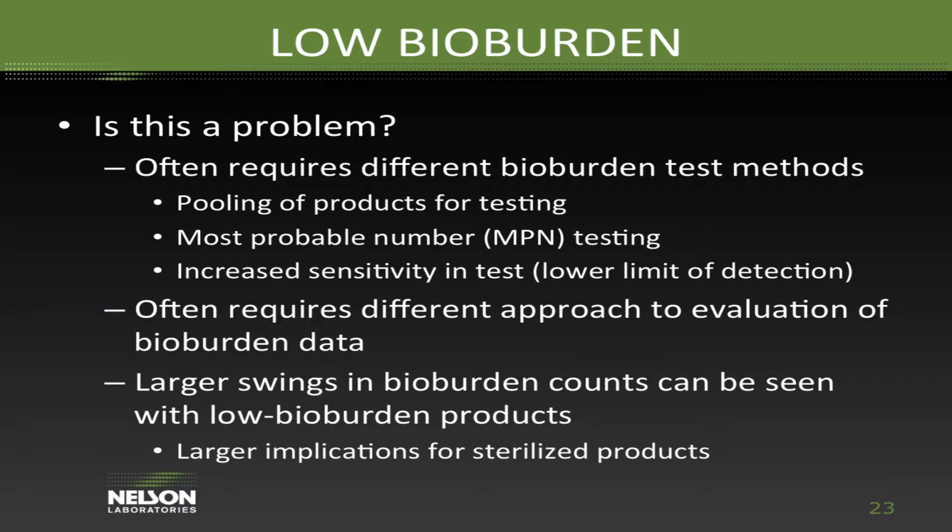Now, another problem with low bioburden is you often have to evaluate the data differently. And I'll go more into that in just a little bit. But the way that you look at the bioburden data you obtain often changes when you have low bioburden.